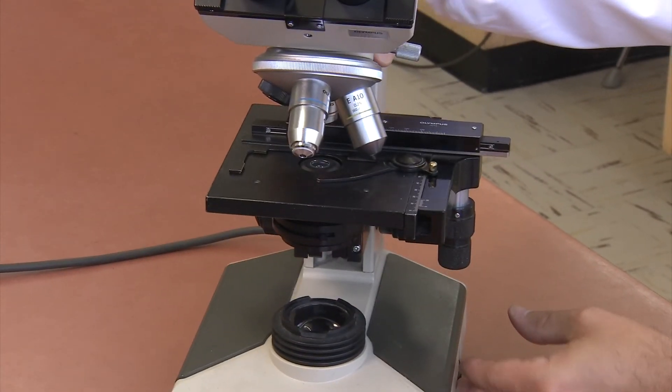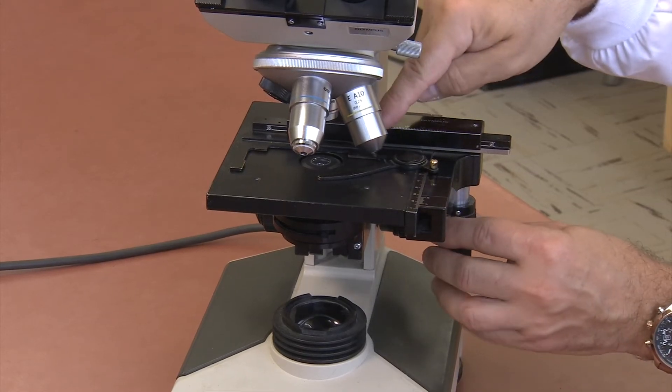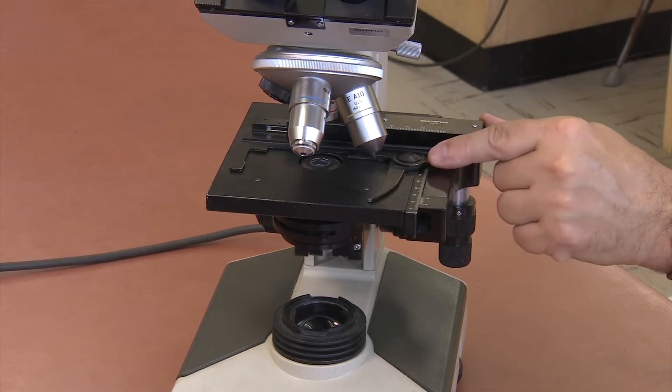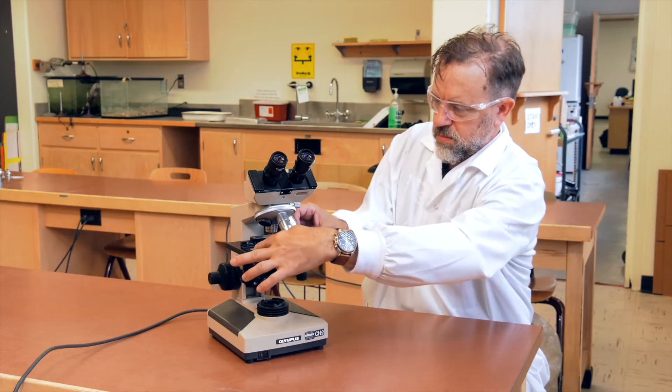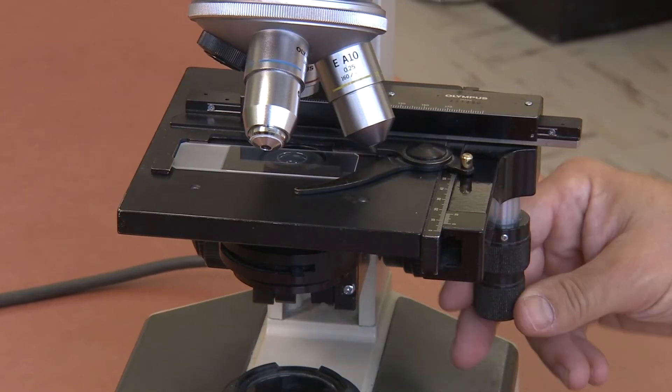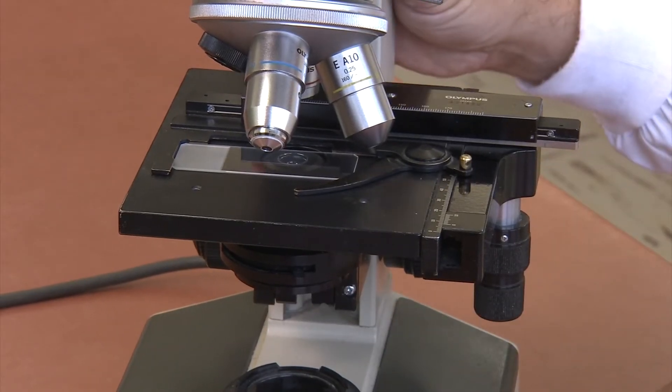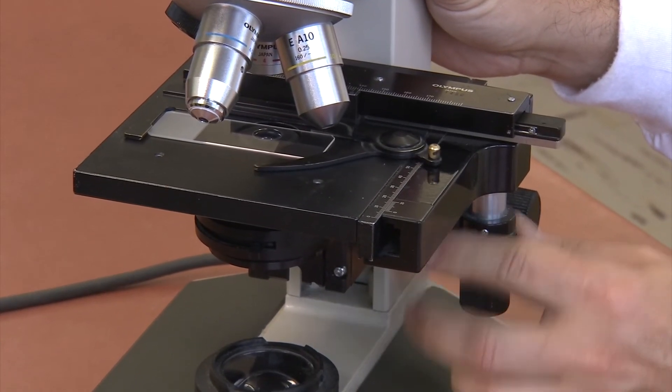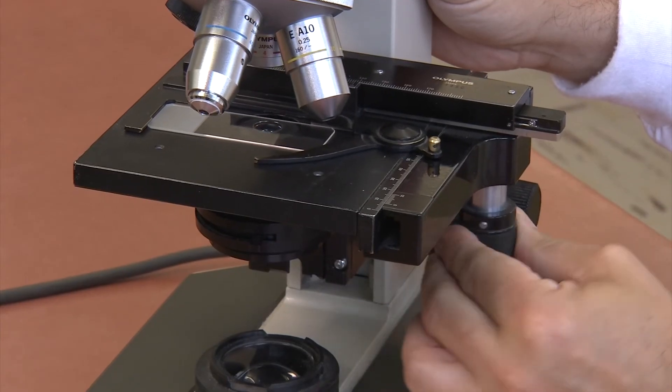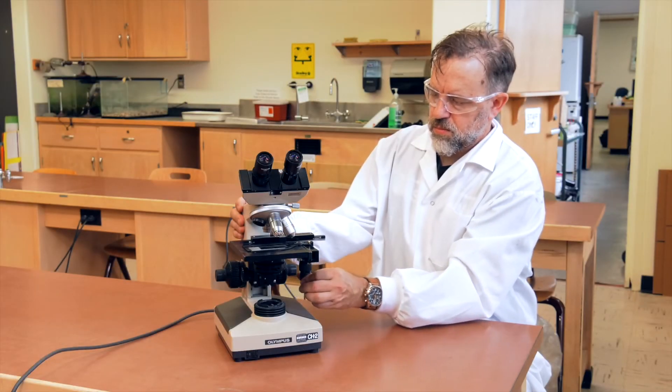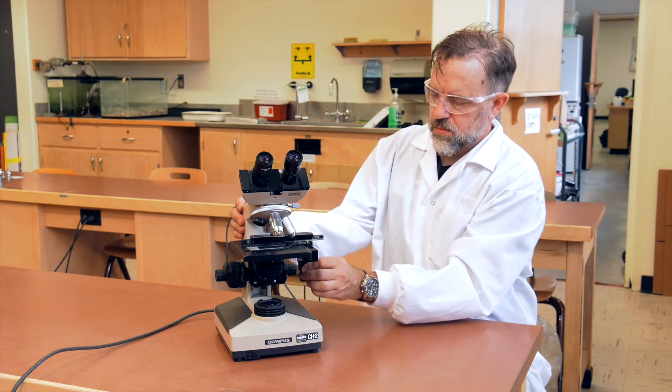Below the objective lenses is the mechanical stage. This is where your slides will be placed and secured by the spring-loaded slide holder. The slide holder is controlled by the mechanical stage controls, which are the small knobs attached directly to the right side of the stage. These controls will allow you to move the slide forward, back, and side to side.